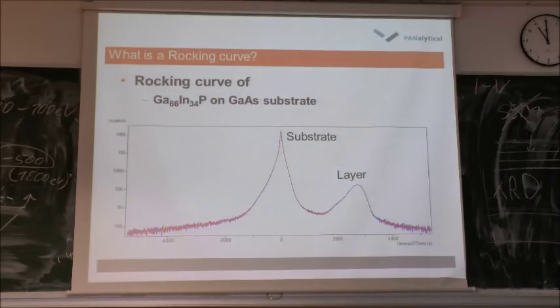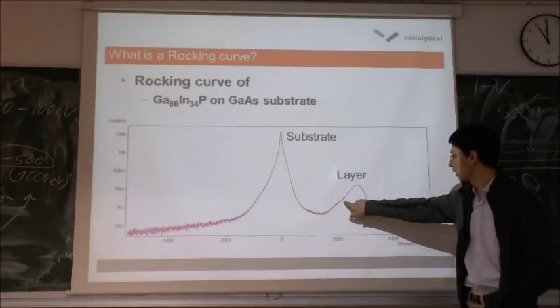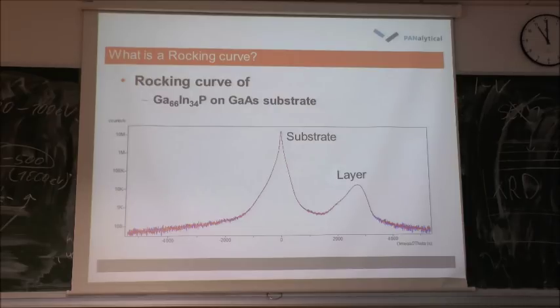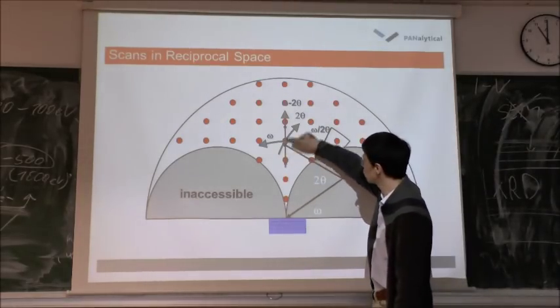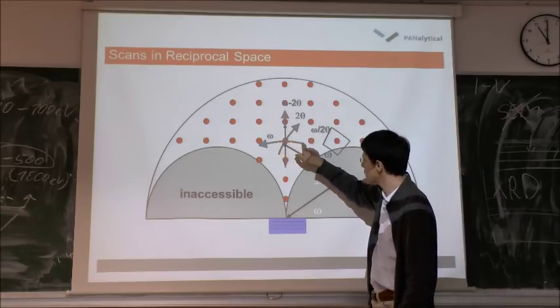This is done on, let's say here, this film and this substrate, and based on the rocking curve, you can calculate the full width half max for your film and for your layer. This is the value which is used to characterize the mosaic spread of your films. As I said, the broadening in this direction is described by mosaicity. So if you do scanning this way, you cannot describe mosaicity. Broadening in mosaicity is described in this way, so you need to do a rocking curve.